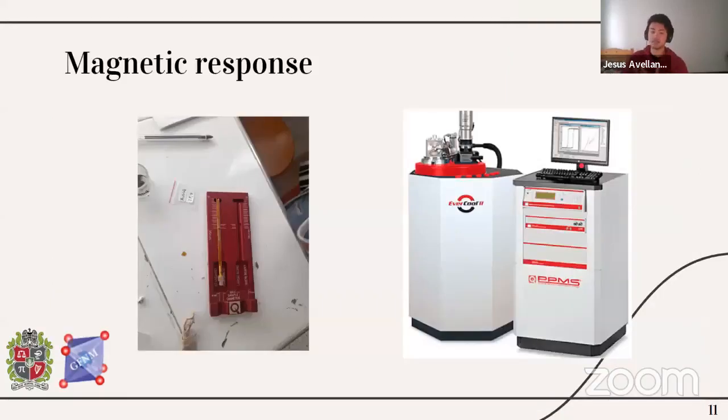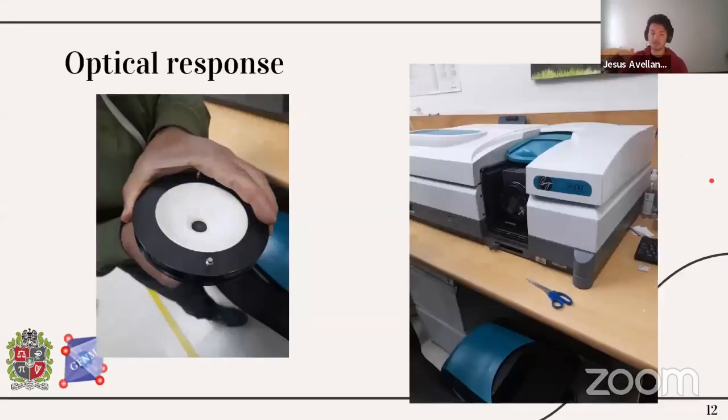Also, for the magnetic measurements, the UPTC, through Ms. Milena Saavedra and Professor Carlos Parra, if I'm not mistaken, allowed us to use a VSM to perform the magnetic response measurements. And finally, the optical response was a plus for the work, because we had problems with the electrical response machine. The day that we were supposed to take those measurements, the machine broke. So we thought that at that time we were able to obtain relevant data through an optical response analysis.